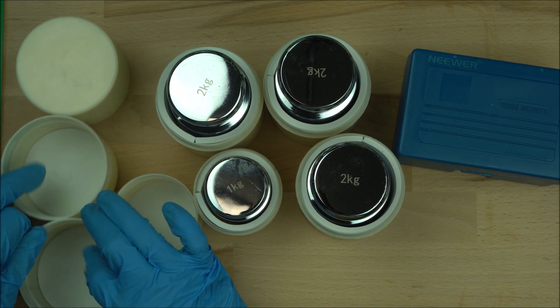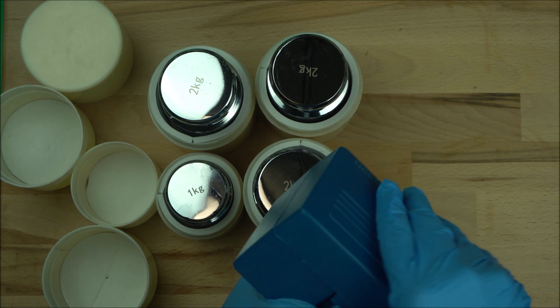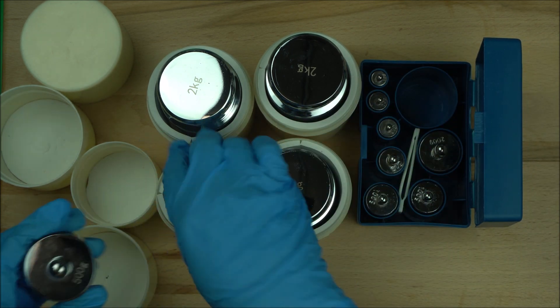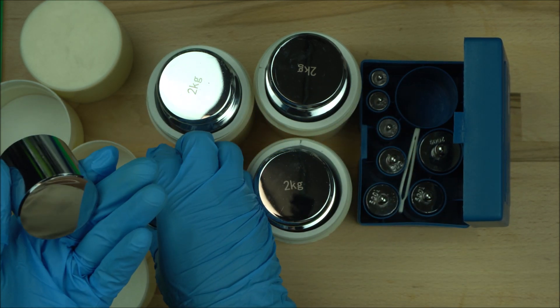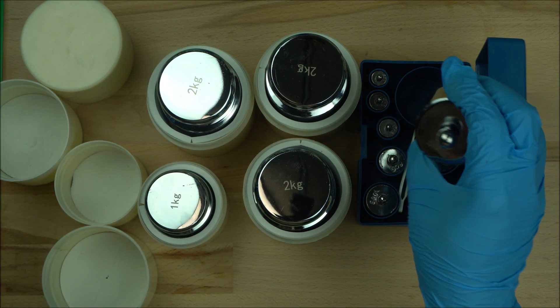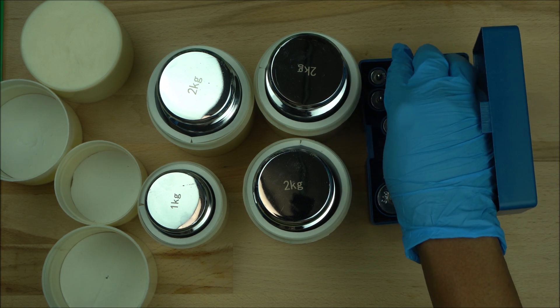And I also have a set. Now this set is by Neewer, as you can see. They are not—the quality of these are not as good as this one, right? But both—they're both not brand names. So this Neewer is not as big a brand name as the other ones you see out there.